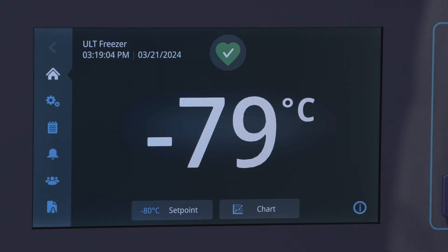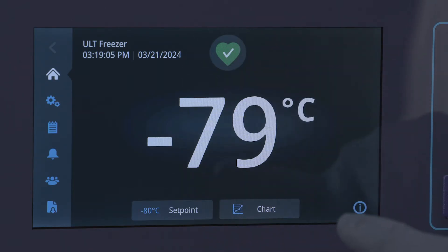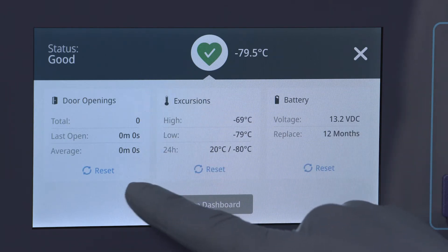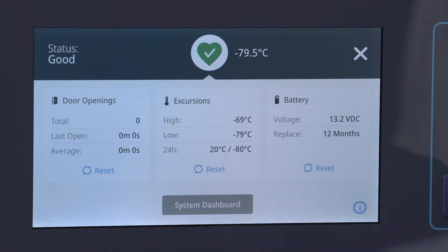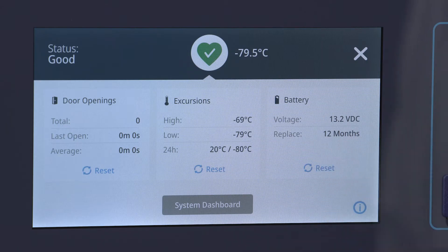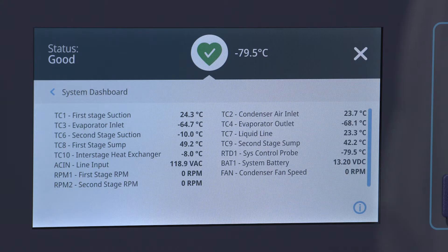If you press the heart health indicator, you'll see the freezer's current status with information about door openings, temperature excursions, and power operation. You can also navigate to the system dashboard to view all onboard telemetry for diagnostic purposes.